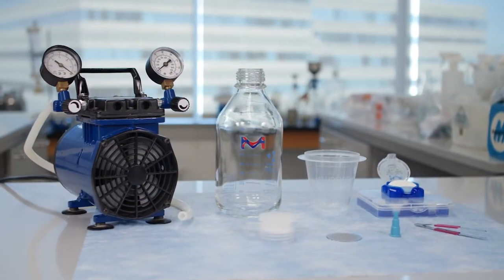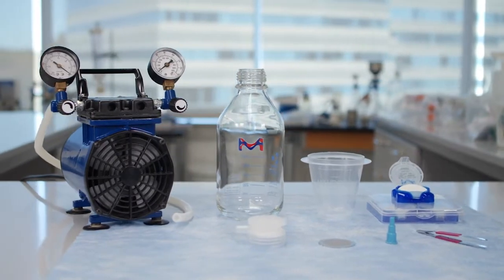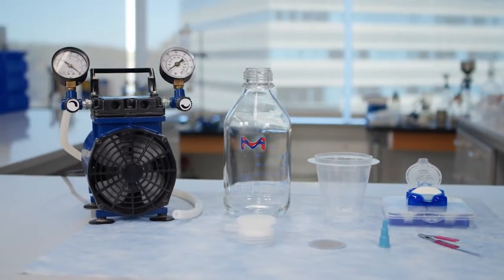The Millicup Flex is a disposable vacuum filtration system that provides a time-saving alternative to traditional glassware setups.